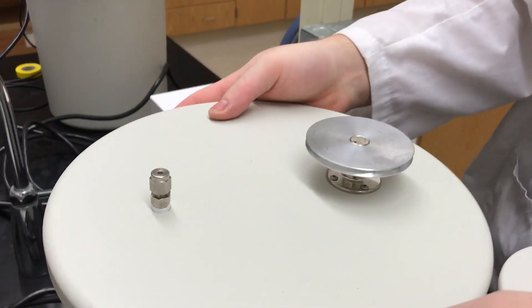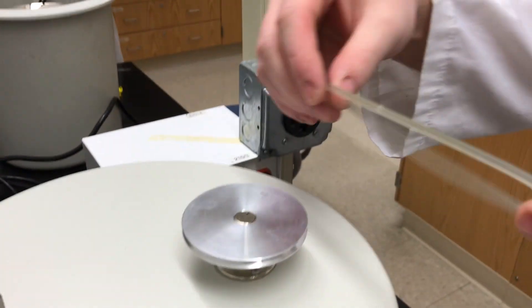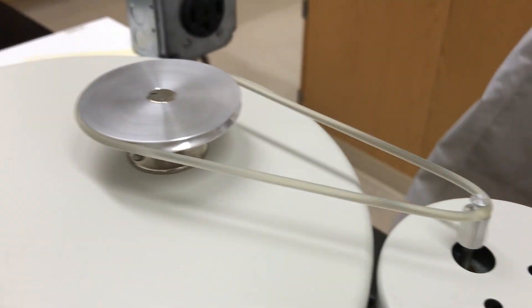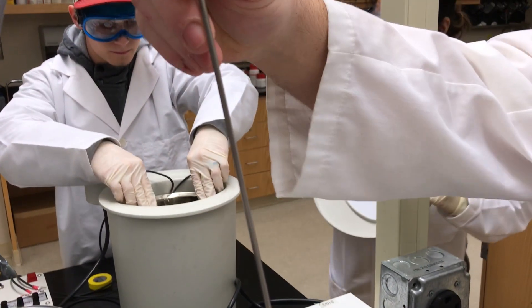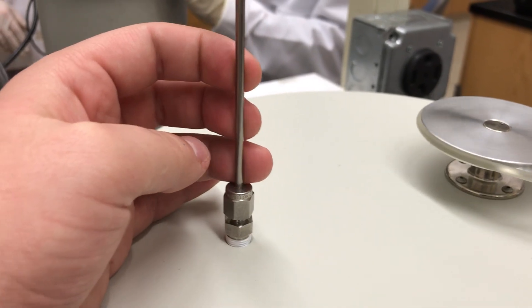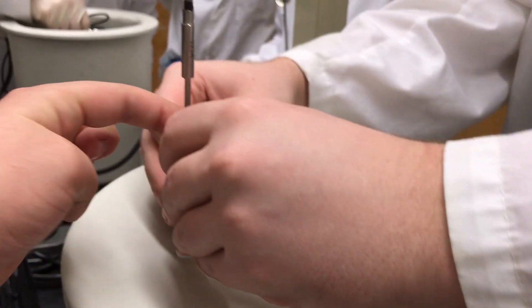Now we're going to check the stirring rod again, make sure it's free from obstruction. Attach the drive belt to the motor — there's a little inclusion there so it fits snugly. Standing on the side, make sure again it's free from obstruction. We're inserting the thermometer now. Make sure, like with all experiments, the thermometer does not touch the bottom or sides of the system. Here we'll be using tape to secure it.